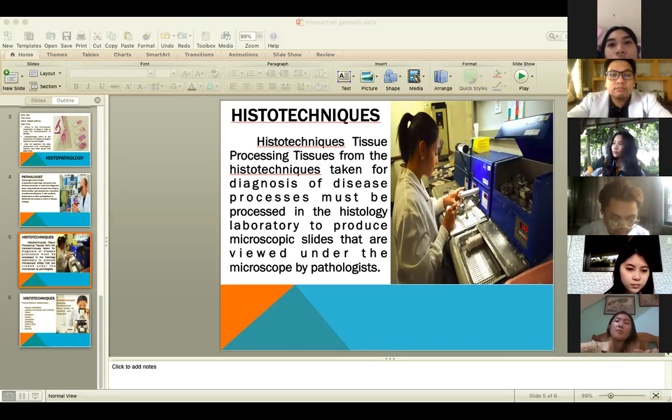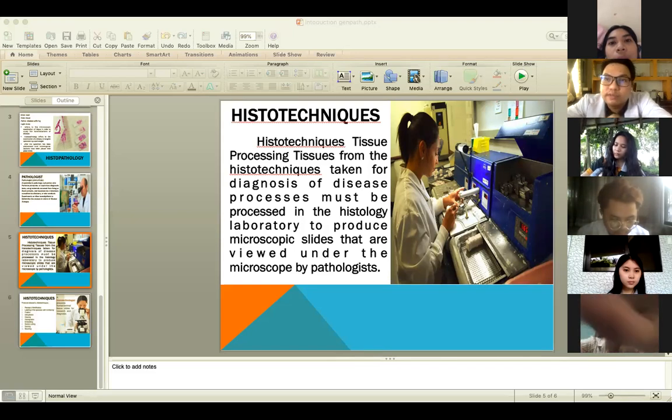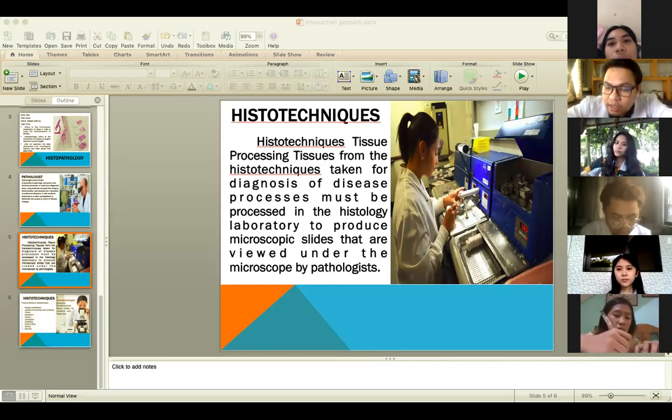So, first method for tissue examination is teasing or dissociation. The process whereby selected tissue specimen is immersed in a watch glass containing isotonic salt solution. Okay, NSS, tissue, and then we're going to observe it in the microscope. Ito yung pinaka-easy, ito yung pinakamadaling method of fresh tissue examination. The tissue, NSS, and microscope. So what do you think NSS siya? Okay, NSS is isotonic. Okay.